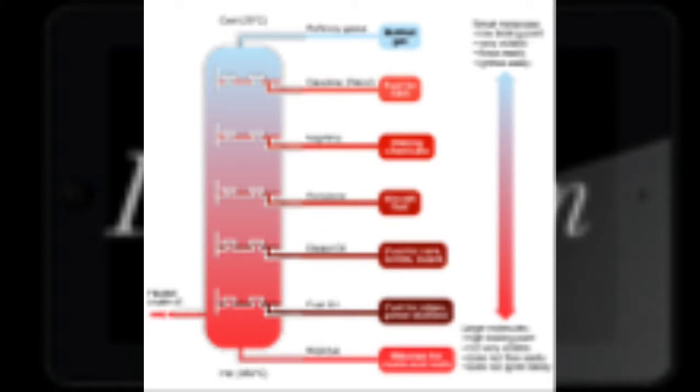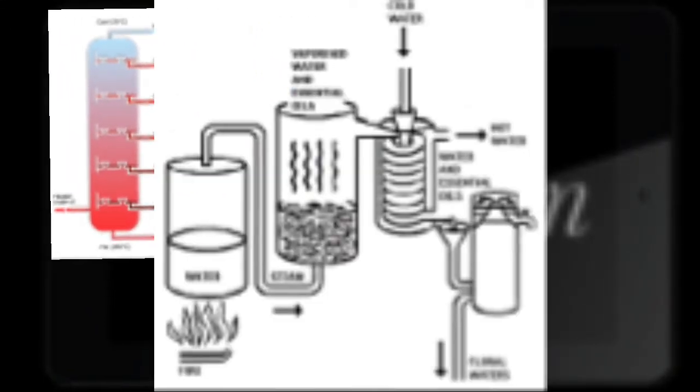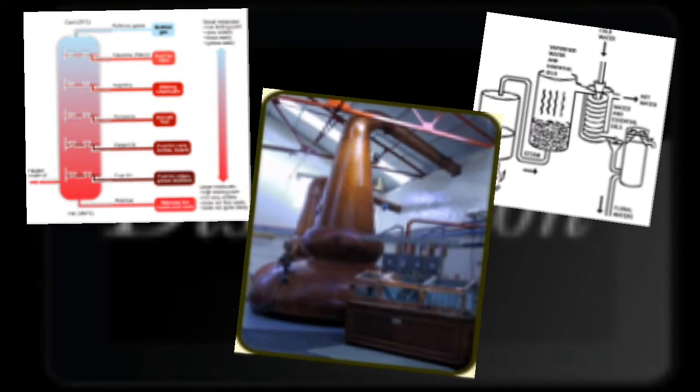Distillation is widely used in the real world, such as in fuel production from crude oil and the production of essential oils or liquids. It is a method of separating mixtures of liquids based on the difference in volatilities of the components. In this experiment, the ethanol will evaporate fast as its boiling point is lower than water. The condensers cool down the ethanol vapor with running water, condense the vapor, and collect the distillate.